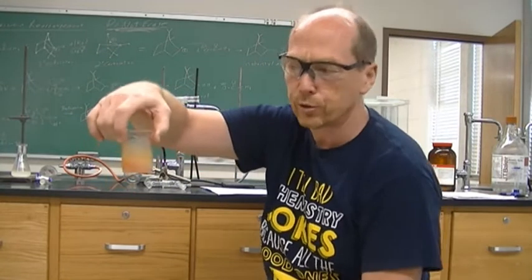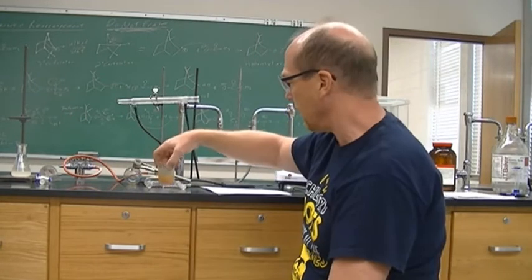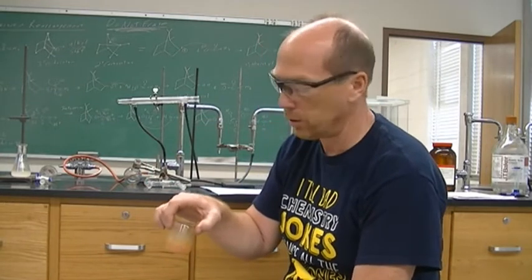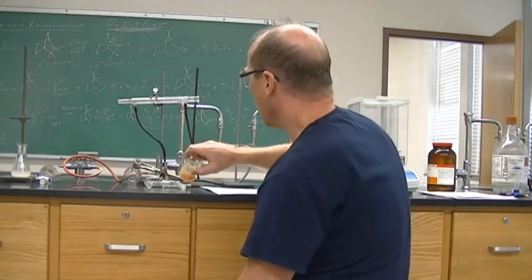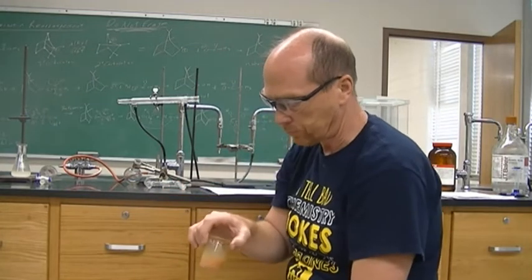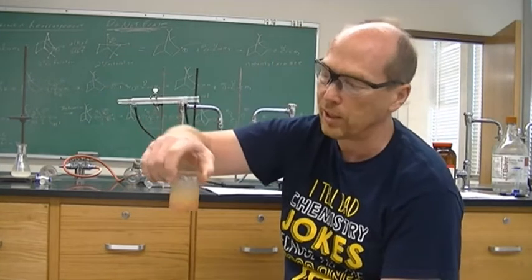Now, oils can get very tricky. Sometimes they actually go through filter paper and you lose your yield. You want it to be as solid as possible. And then we have to wait for the ice to melt, because that will not go through the filter either, because ice is a solid. So we have to melt all the ice, send it through. And so you can see that it's sticking to the sides. It's not a nice solid. It is more of an oily solid, not a crystal solid. But it's definitely solid.